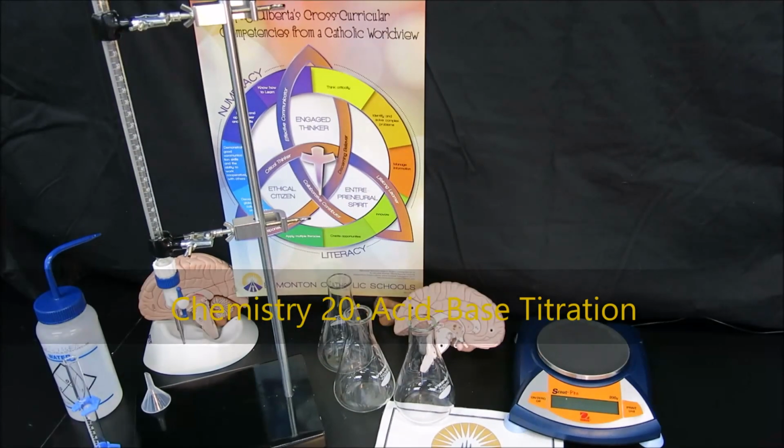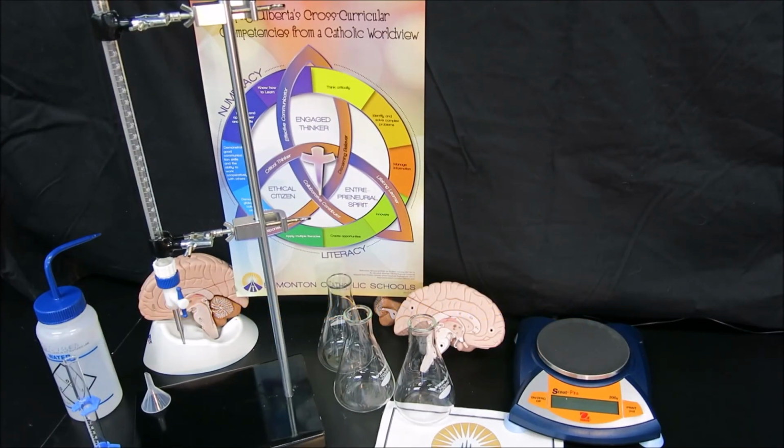In this lab, we're going to be determining the concentration of an unknown sample, and in this lab specifically our sample is going to be sodium hydroxide, so a base. To determine the unknown concentration, we are actually going to use a titrant and perform a titration.